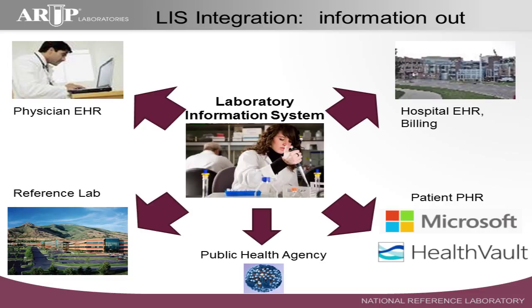So a lot of doctors have their practices, they have their own individual electronic medical records in their practice. And more hospitals share their records with those doctors, especially when those doctors have privileges to practice in that hospital. And of course, we can't leave out the reference labs like ARUP.